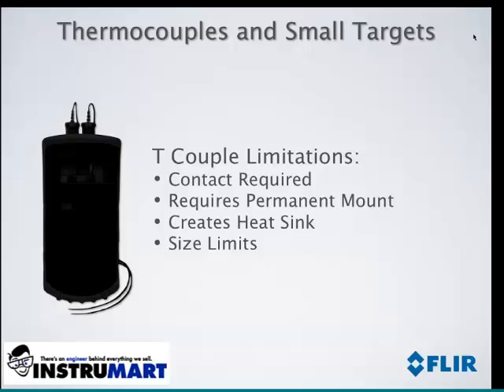And finally, of course, some targets are so small that the thermocouple becomes too large, so that we cannot apply the thermocouple to that target of interest. They're just size limited.